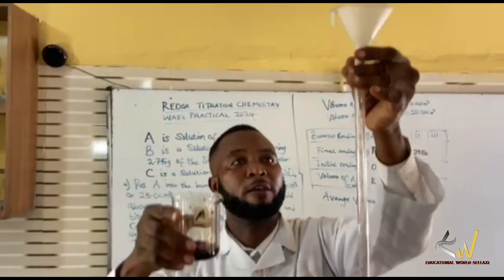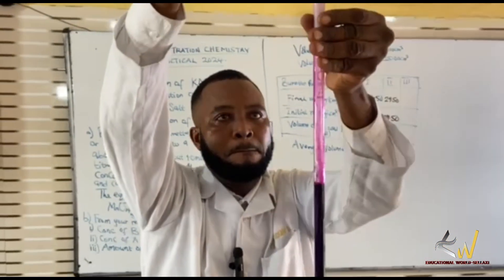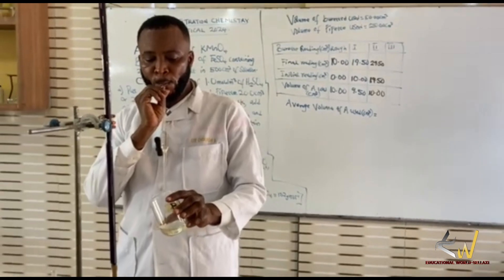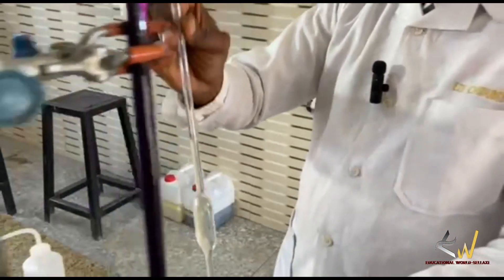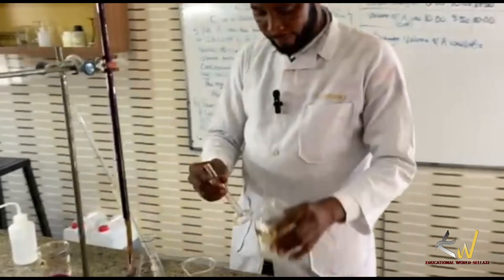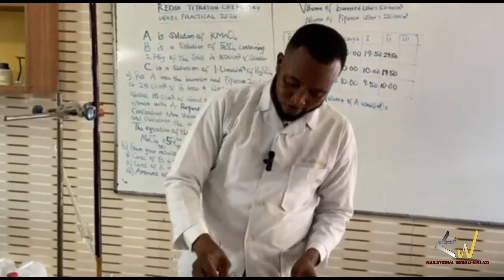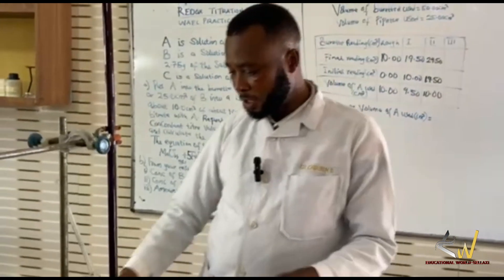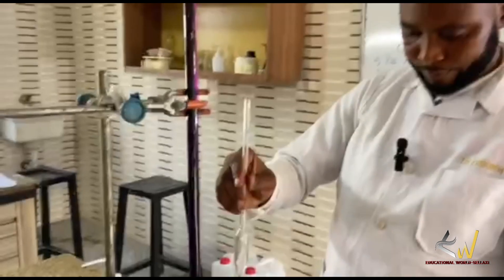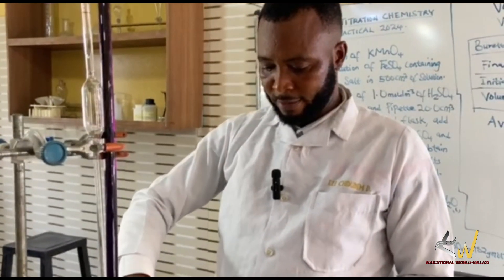So I can get a concordant reading to use. Be careful so that I don't contaminate with the iron sulfate. My 10 mL — dilute tetraoxosulfate(VI) acid for acidification. It supplies the proton, which speeds up the titration. I'm ready now to go — the final lap.